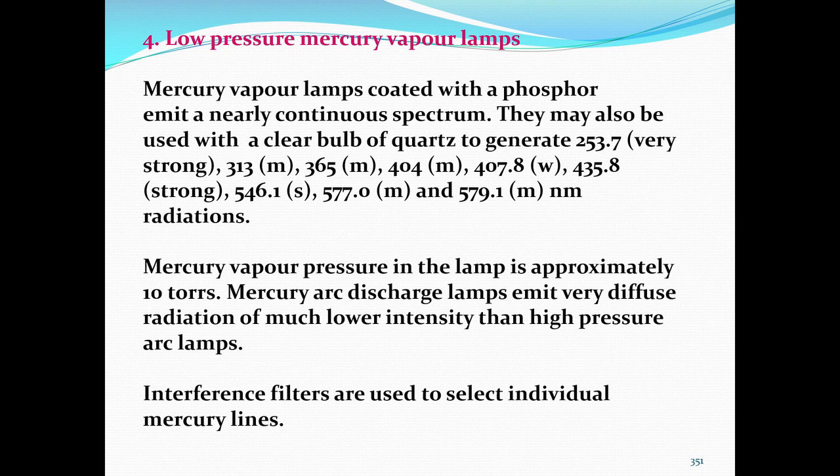I can use a mercury vapor lamp in a low-end spectrofluorimeter with filters instead of monochromators. If I use a xenon lamp, I have to use a monochromator to get plus or minus 0.2 nanometer accuracy, whereas in mercury vapor lamps I can go for filters. Filters are cheaper compared to monochromators; lenses, mirrors and all those things are avoided if I use a filter.